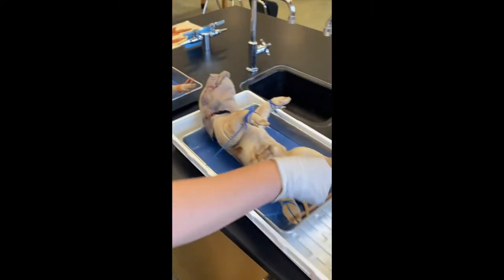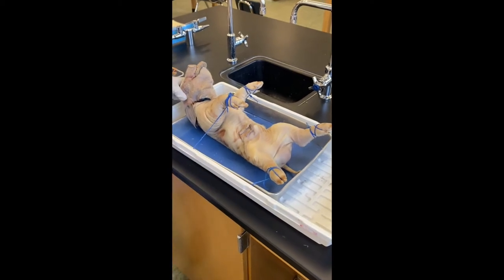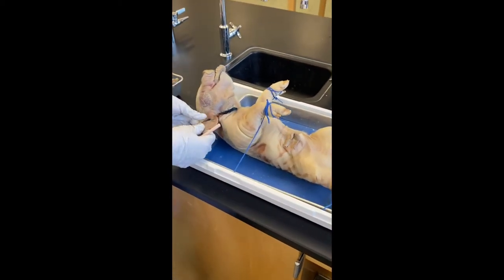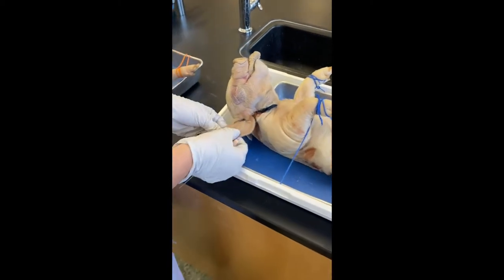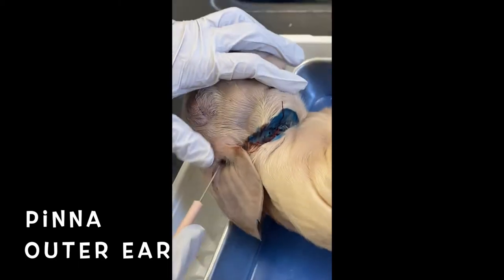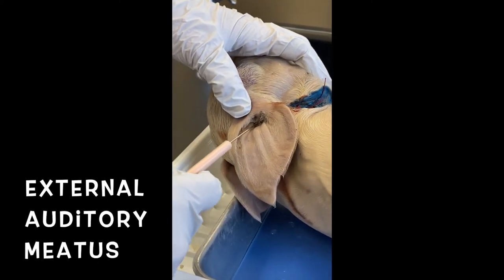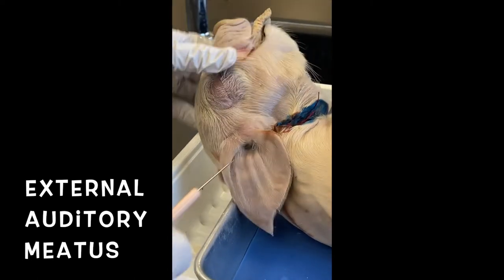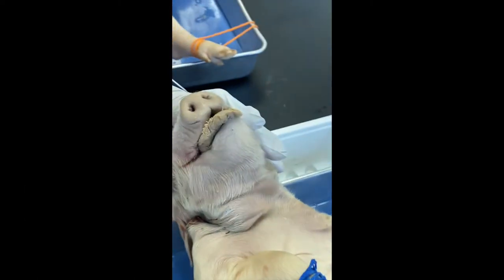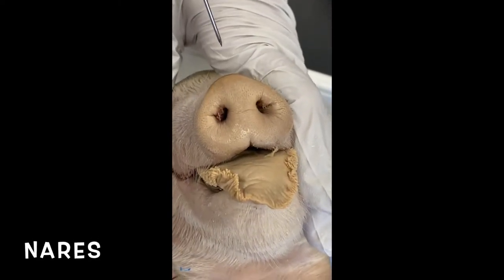So continuing on with external anatomy, I'm going to move to the male here. A couple things I just want to go over. On the ear, the actual ear flap, all of this exterior part, is called the pinna. And then the actual opening here, where sound goes in and out, is the external auditory meatus. The nostrils on a pig, two nostrils here, are called nares.